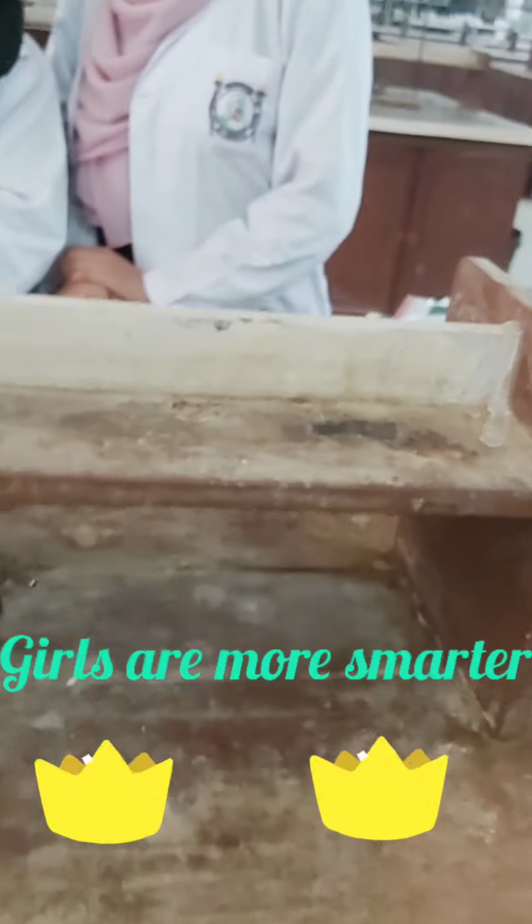Girls, this is the girls' side. Girls are doing it nicely. As they are new, and they are doing it after many years, they are attempting to record the melting point, so they are a little bit out of practice, but they'll learn.